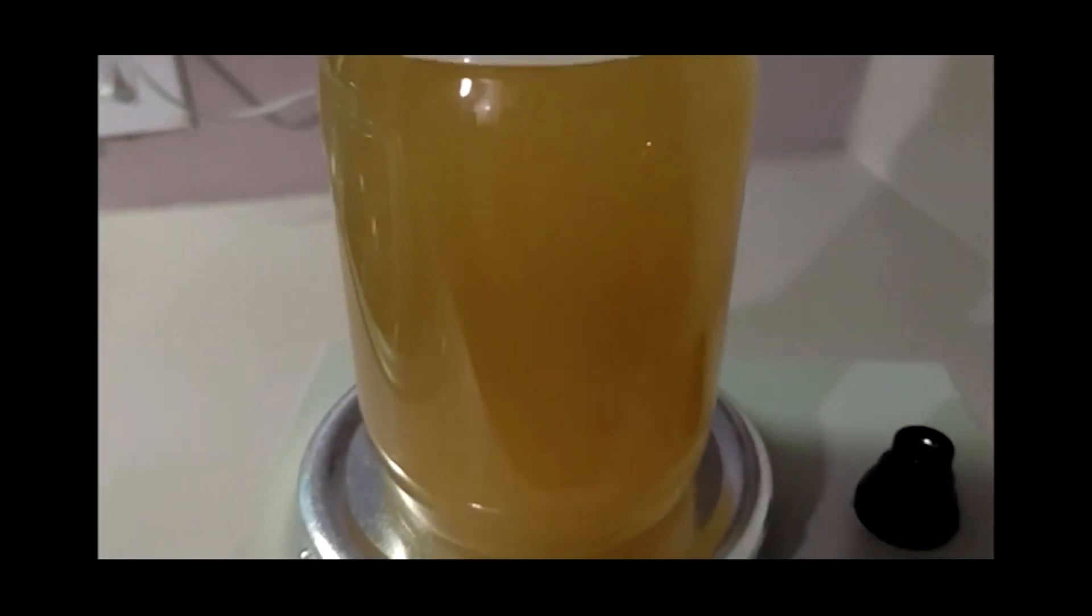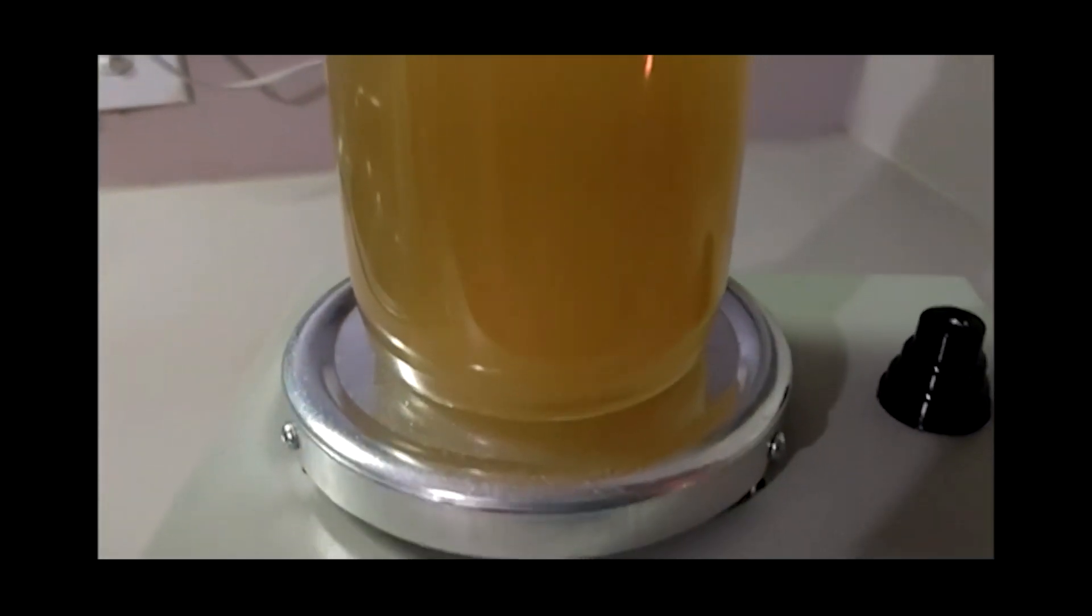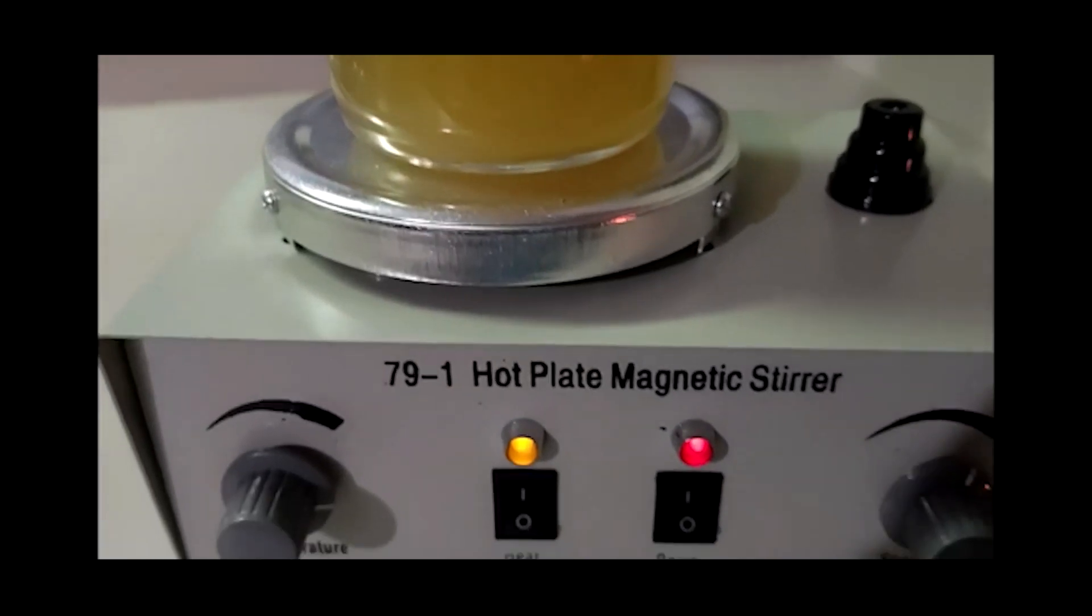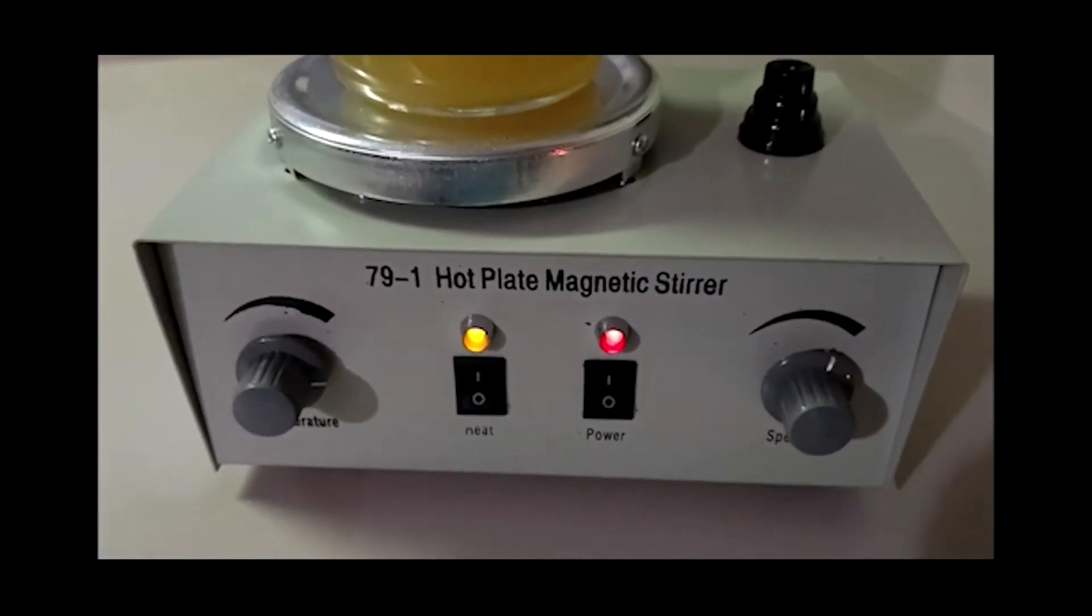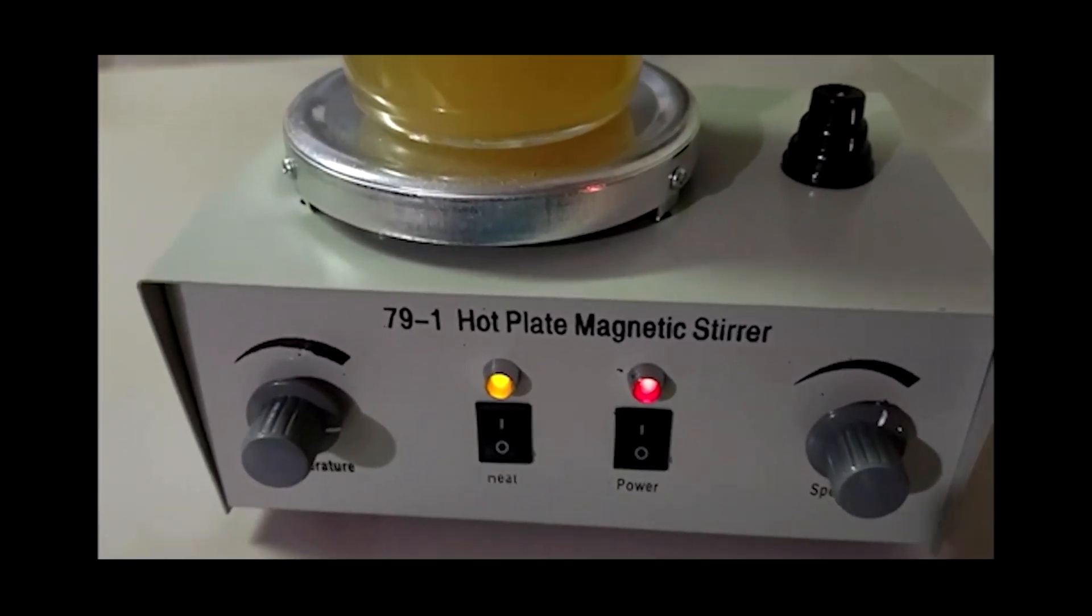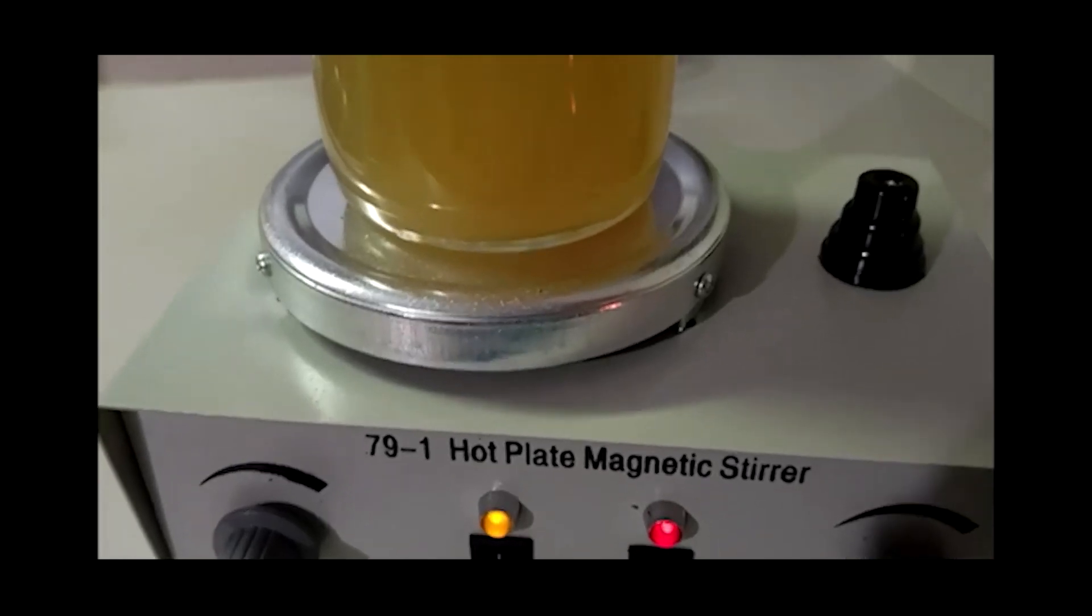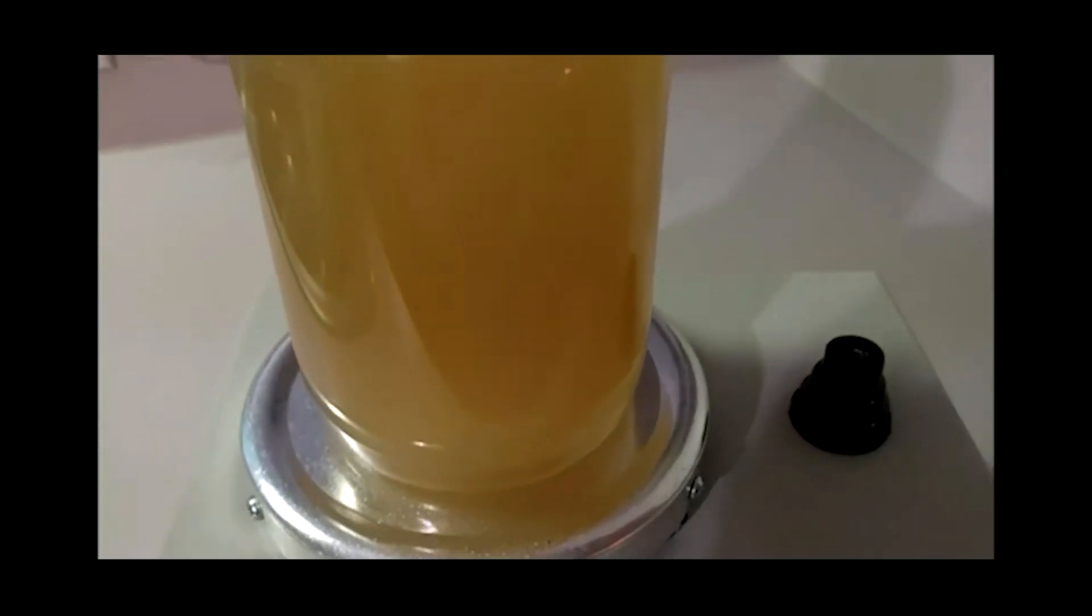We started with the standard 10 grams agar, 10 grams malt extract per 500 milliliters of purified water and definitely got quick tomentose growth, but it was hard to determine what was good mycelium and what was possible contamination.